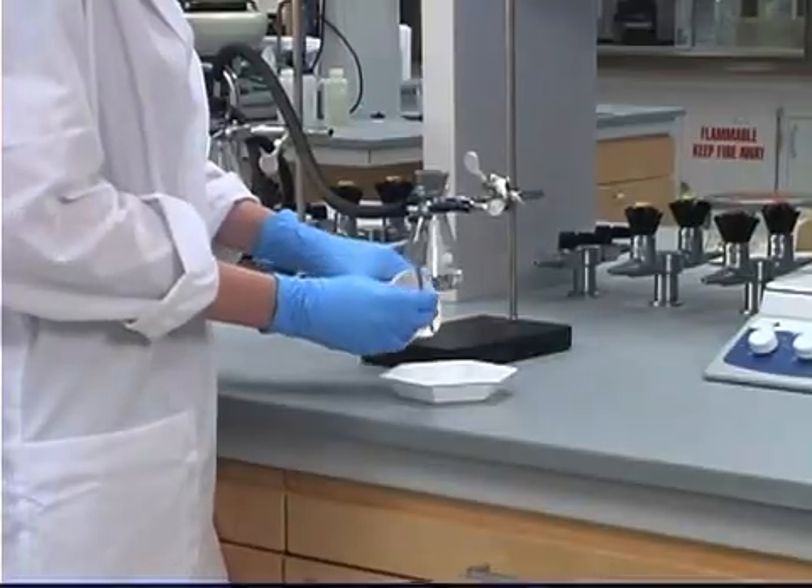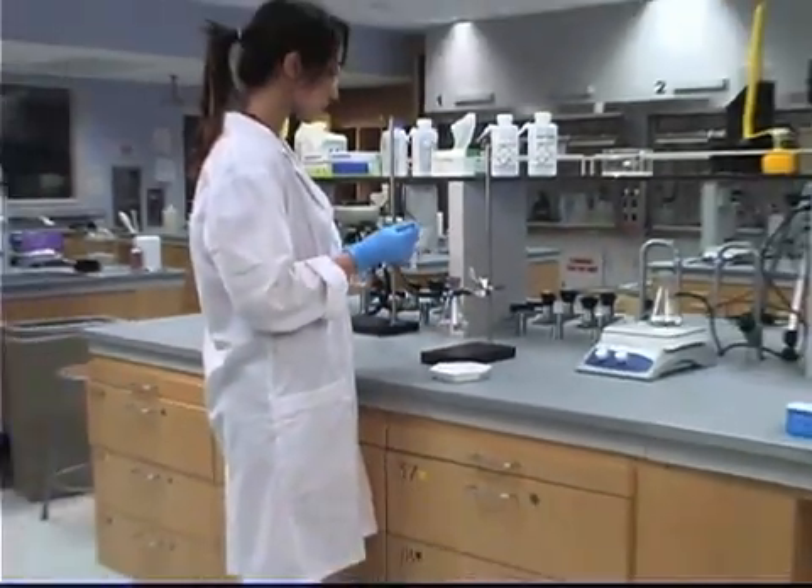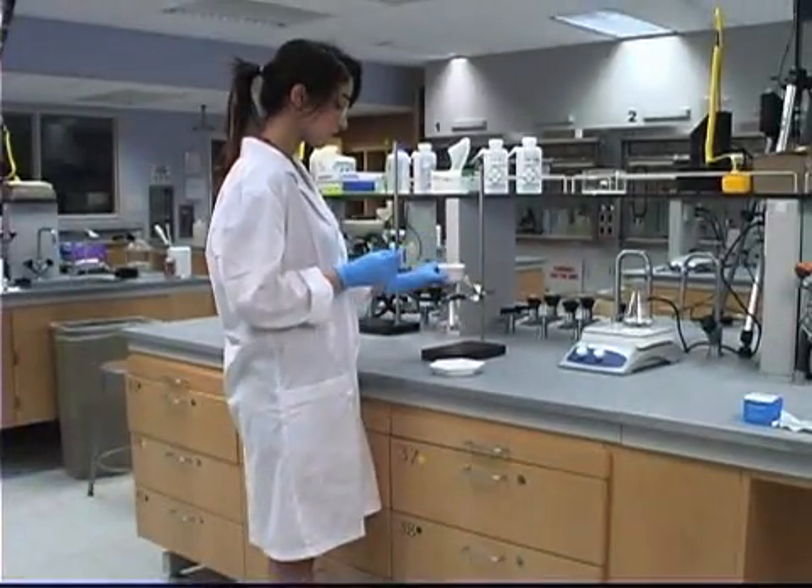We have finally isolated our purified crystals from the soluble impurities in the solvent. All that's left is to simply let them dry. I hope this demonstration on recrystallization will be useful. And good luck in lab.